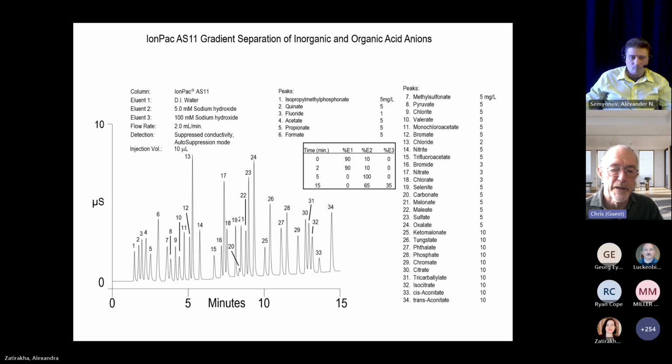And so based on his suggestion, the synthetic chemists in our group synthesized an epoxy styrene monomer that we used first to make the AS11HC, but then after that, almost all of the aromatic ion exchange materials we made used that same epoxy monomer.